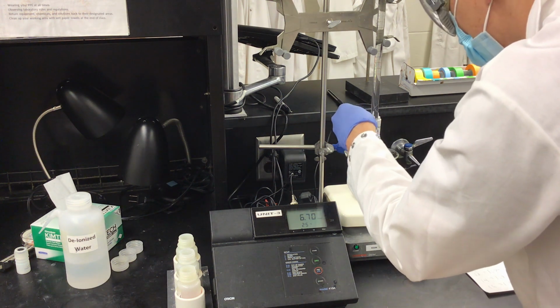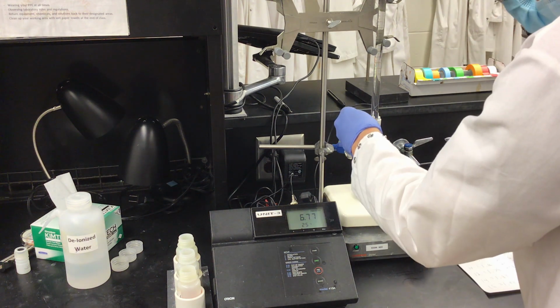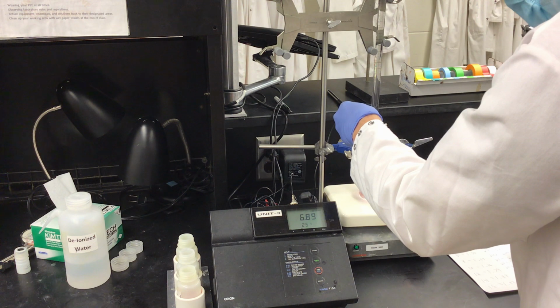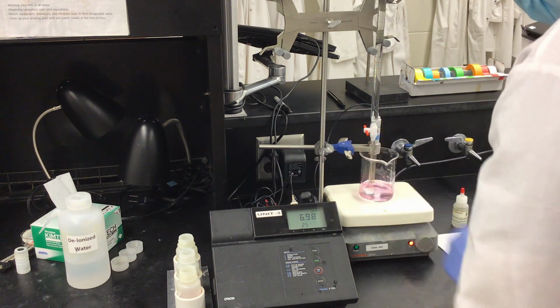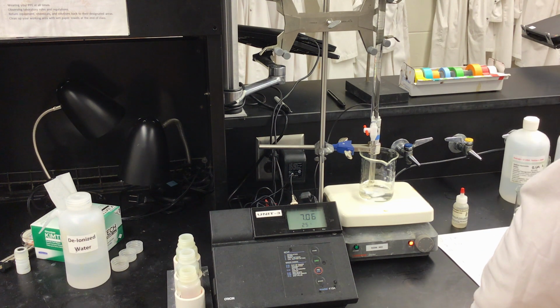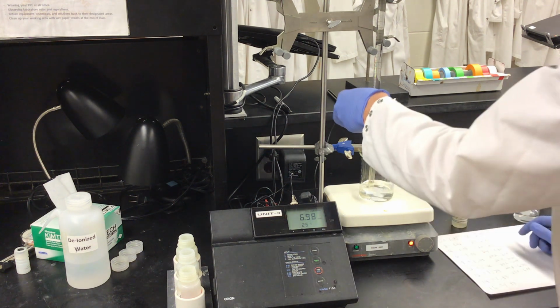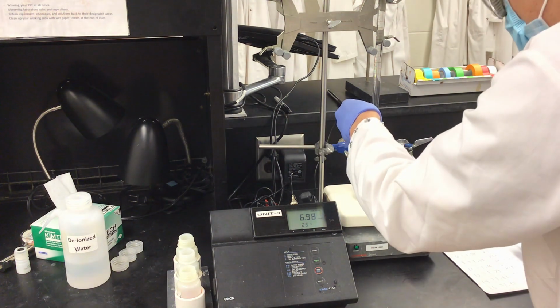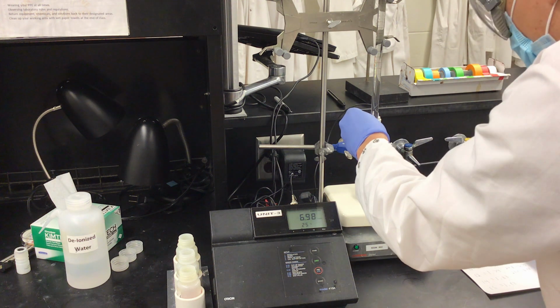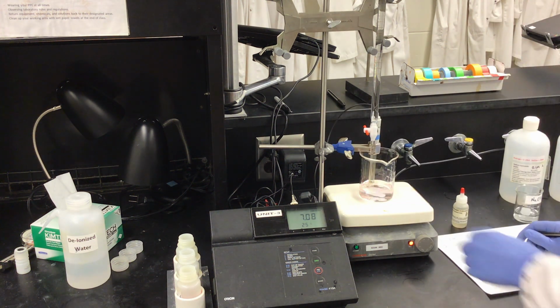We are very close to our endpoint, so I'm going to be very cautious now and watch my solution very carefully as I add my base. I only want to add 1 drop at a time, and now we are at 25 milliliters. Our pH is at 6.98, so we are very, very close to our endpoint according to our pH meter. So again, I'll be very cautious and add drop-wise my solution.